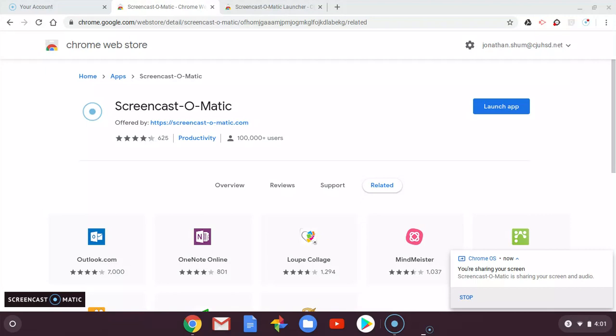You should log in. Make sure you log in as yourself under add person. After you've added person, you'll get to your home screen.